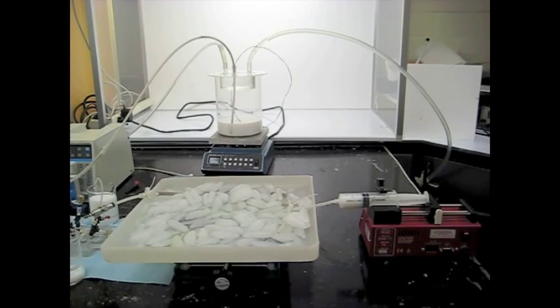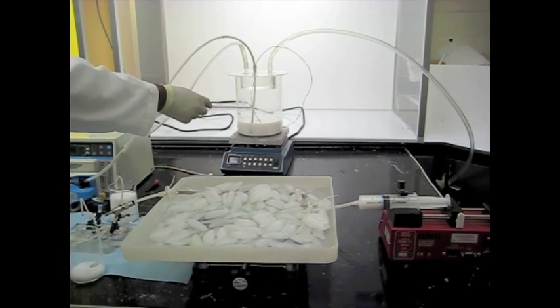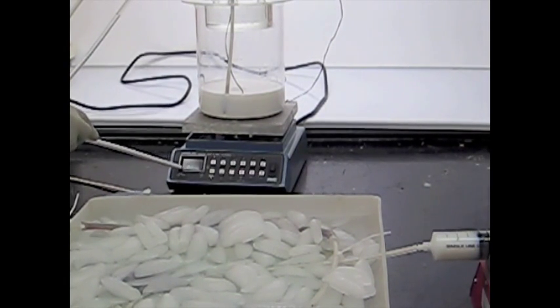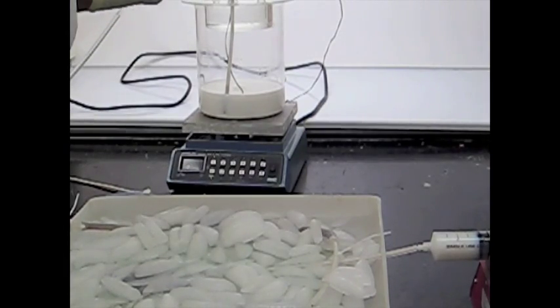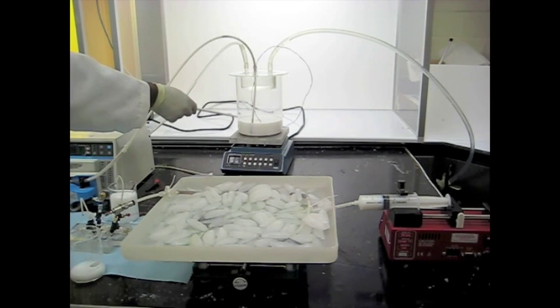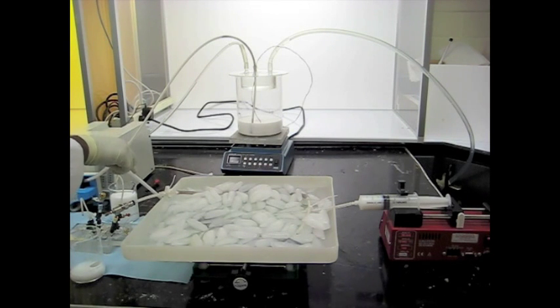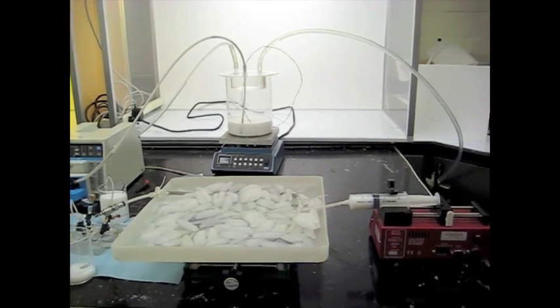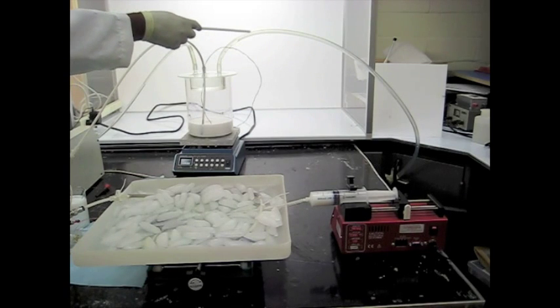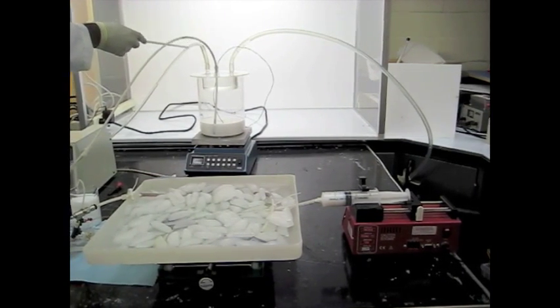The test bench consists of a reflux condenser containing the nanofluid. The condenser is kept on top of a hot plate and the temperature of the nanofluid is maintained at 90 degrees Celsius using a feedback circuit consisting of a temperature probe. The mixture is continuously agitated using a magnetic stirrer. This helps in preventing the sedimentation of nanoparticles as well as to maintain a uniform temperature distribution in the fluid. The reason for using a reflux condenser is to maintain the concentration of the nanofluid at a constant value. This is achieved by condensing the evaporated water by passing cold water through a chamber on the condenser lid.